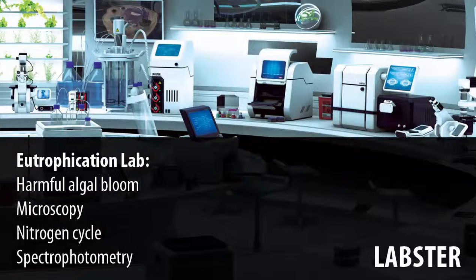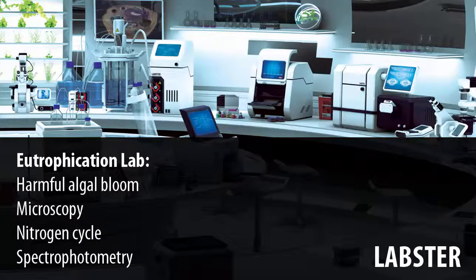Welcome to the Ecology Lab, where students act as an environmental investigator whose mission is to solve a massive fish kill mystery. The Ecology Lab is divided into two labs: Marine Biology and Eutrophication Lab.